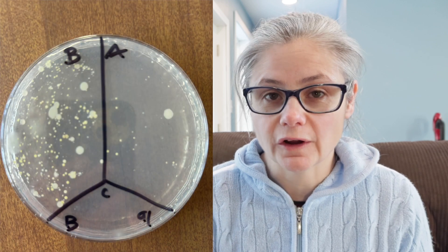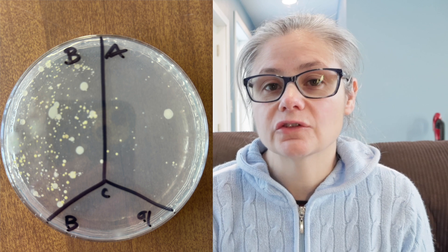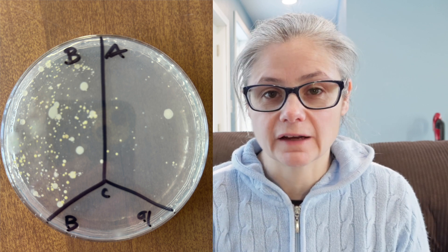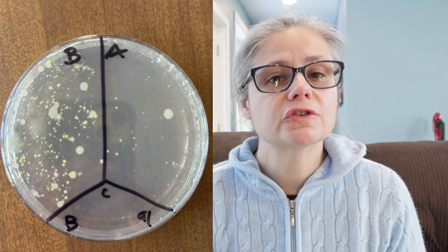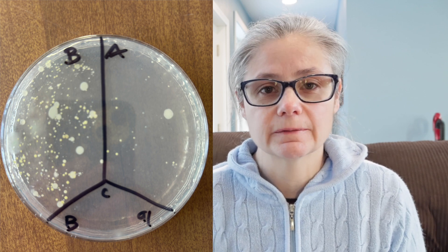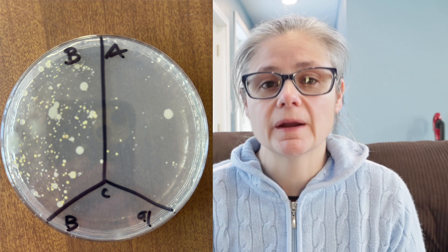Now the bathroom floor. In the before section, we can see a lot of bacteria and different types as well. In the after section, we can see a visible decrease in bacteria. It didn't remove a tremendous amount, but there most certainly is a visible decrease. So the Bona does an okay job at removing the bacteria from my bathroom floor.